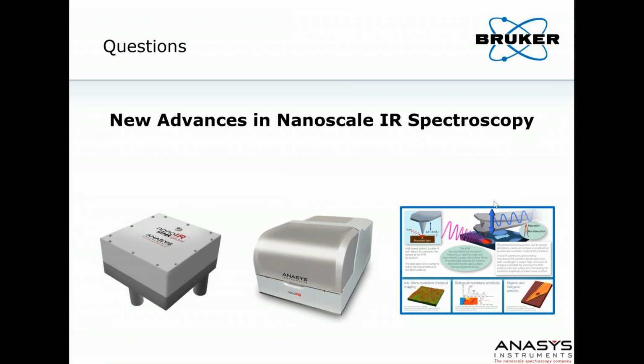So then there are some questions about simultaneous measurement. It says, can Nano IR3 and AFM-IR and SNOM do them simultaneously? So, the short answer is no, but you can.